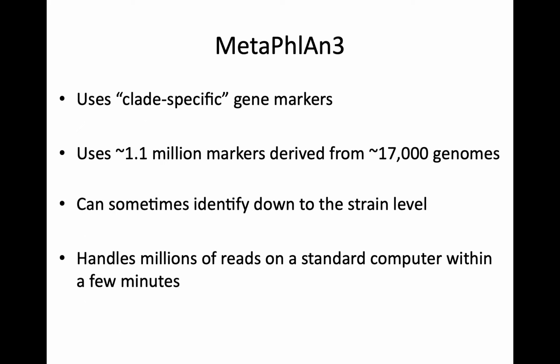And the really big advantage is that you can do this essentially on a decent laptop in a few minutes per sample, right? So you can throw a sample at it, it's going to do taxonomic classification. No large computational requirements are needed for this.